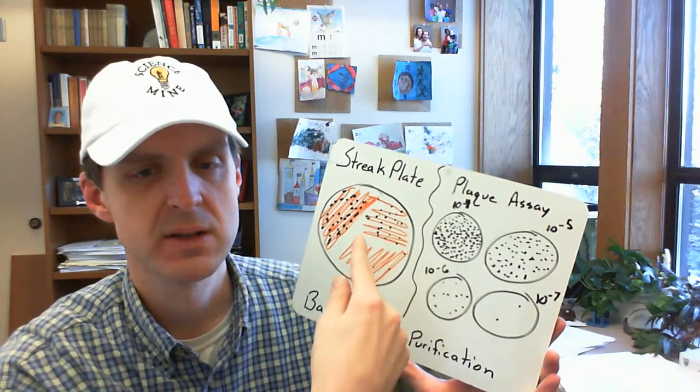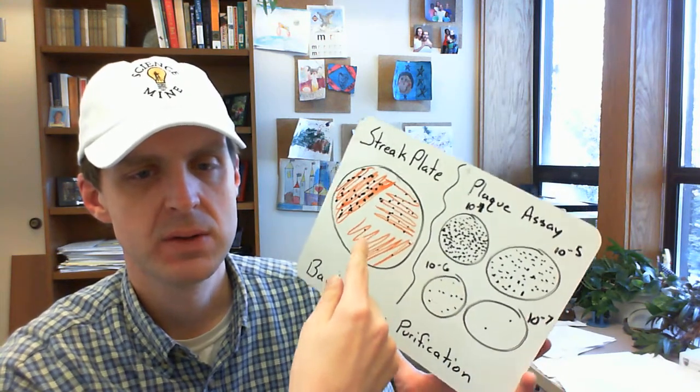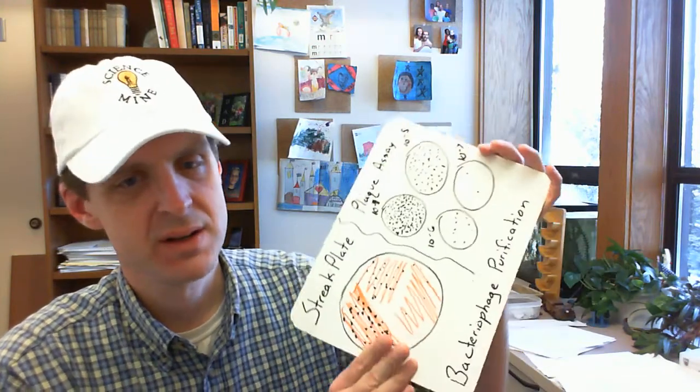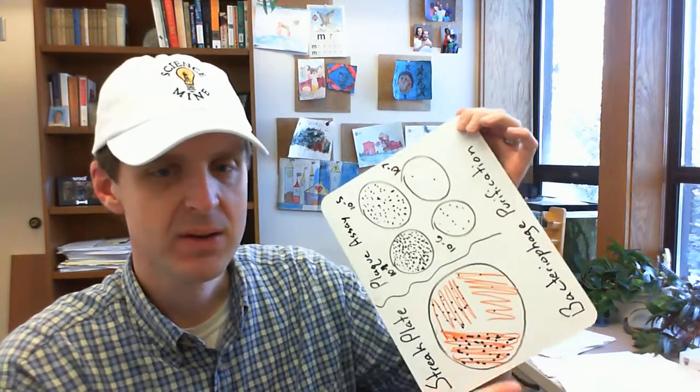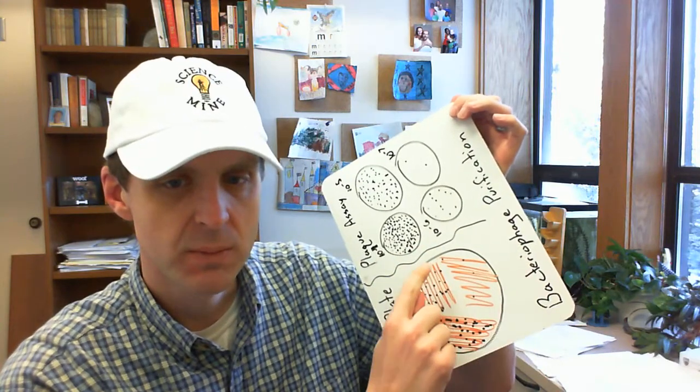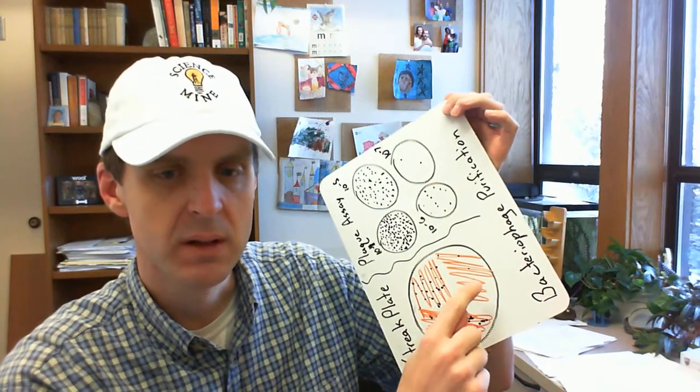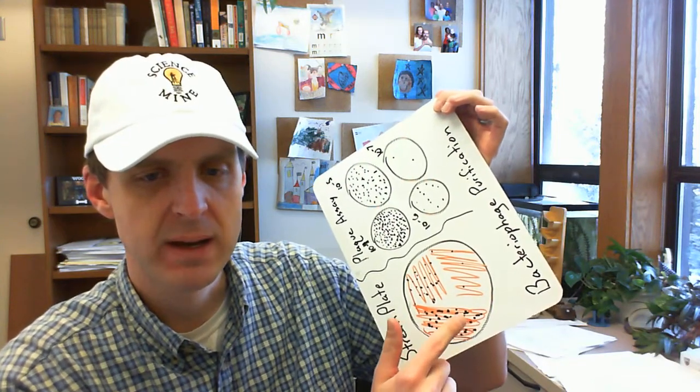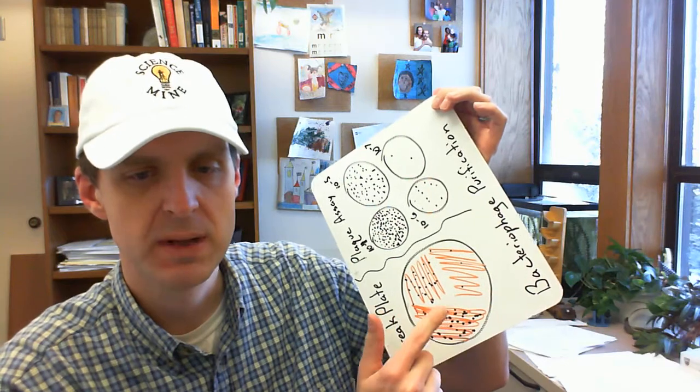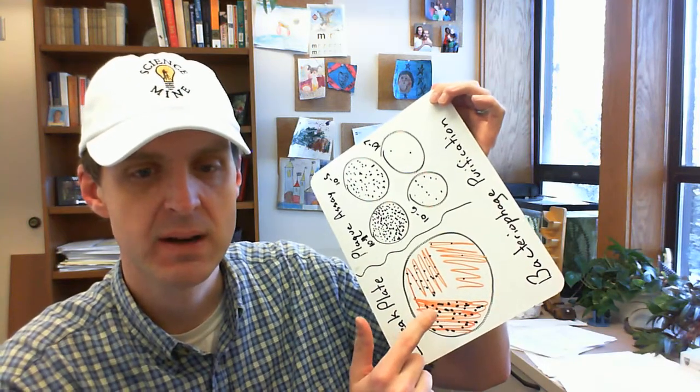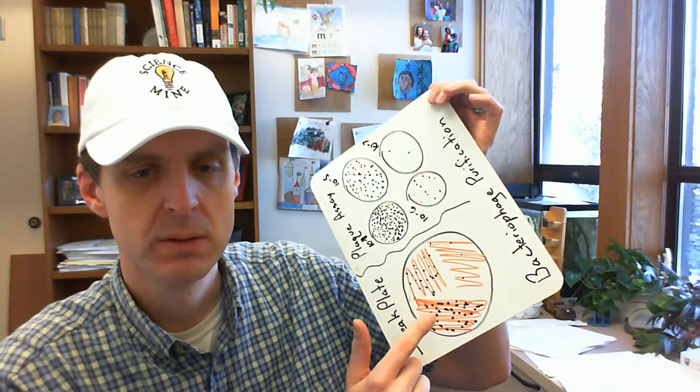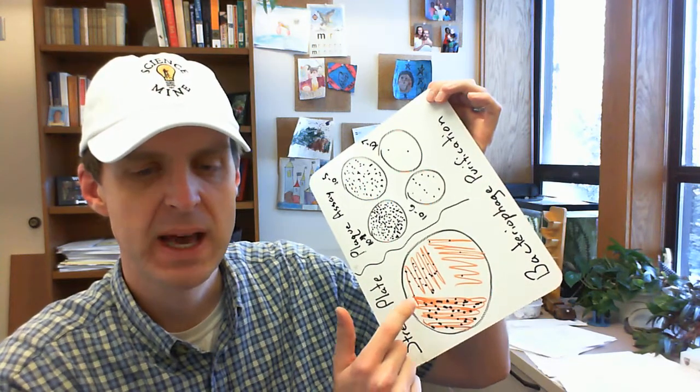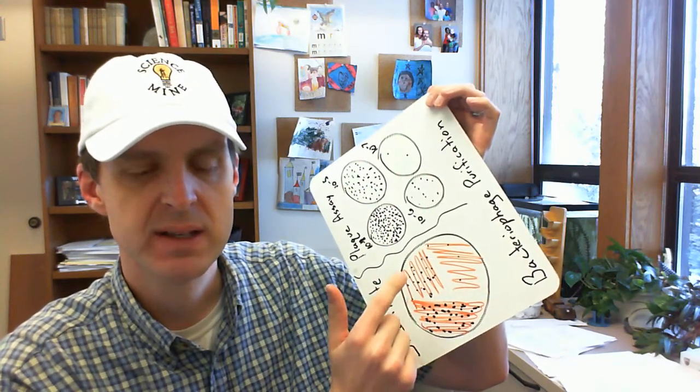You're trying to make one long continuous non-overlapping line that you're dragging out. So the idea is that you should drop off quite a few viruses as you begin and then you turn your plate and you do the last segment. You turn it something like this and then you do that last segment and you drag out a line even longer.